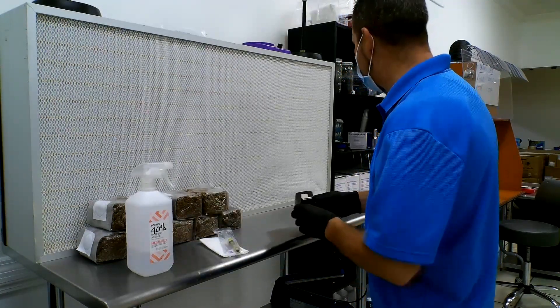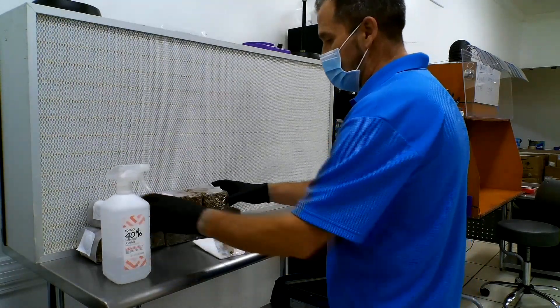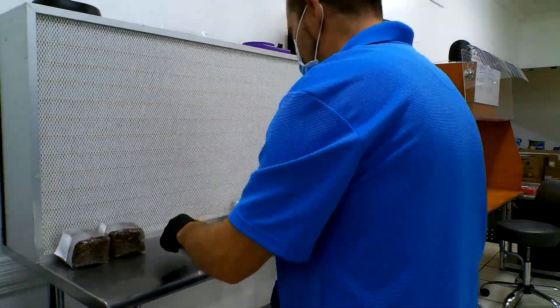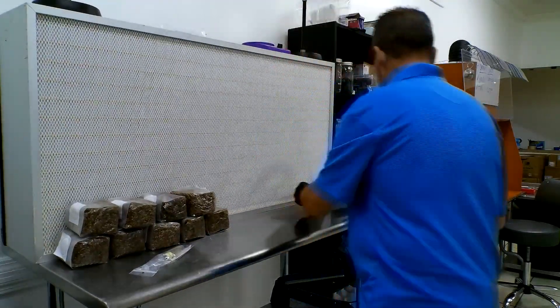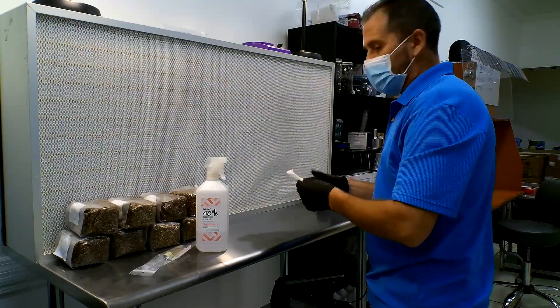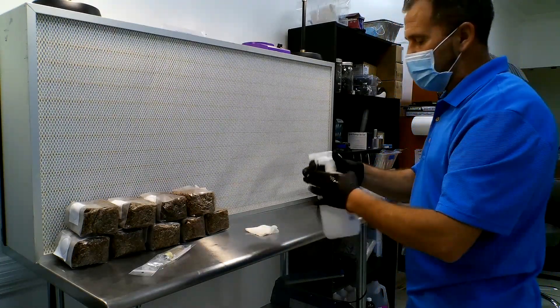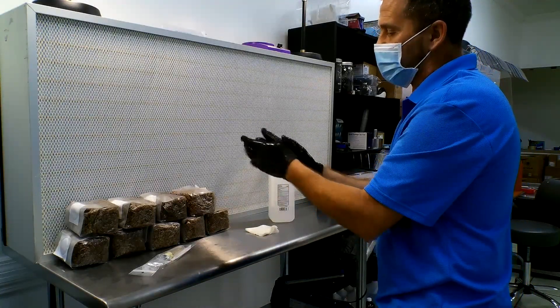This is a very fast process. The first thing I'm going to do is wipe down this entire counter, so I'm moving the rye berries over here. Make sure you have gloves and a mask when you're doing this, and preferably work in front of the flow hood if you can. We're going to spray our hands and wipe everything down.